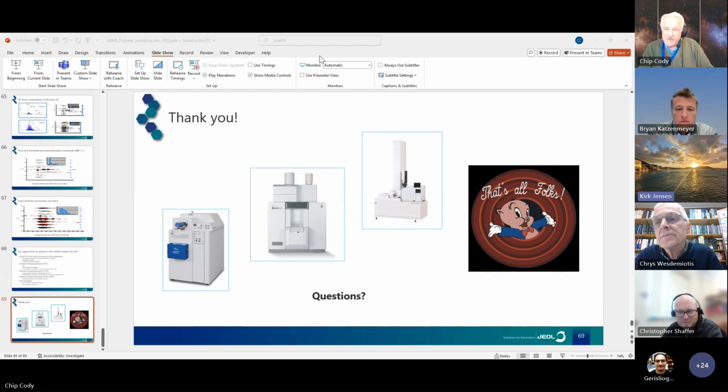Basically there was just this fast breakdown of the pump oil versus what we might normally expect in a few weeks, I think. Even just in visible appearance, the used pump oil was darker, and I'm attributing that to all the conjugation and the polyunsaturated materials there.